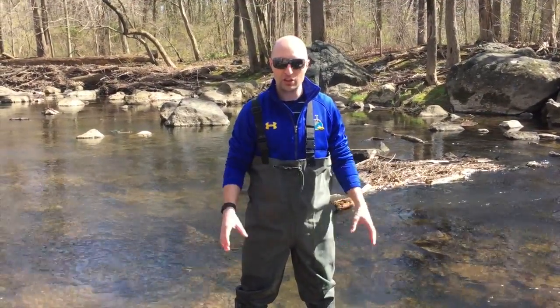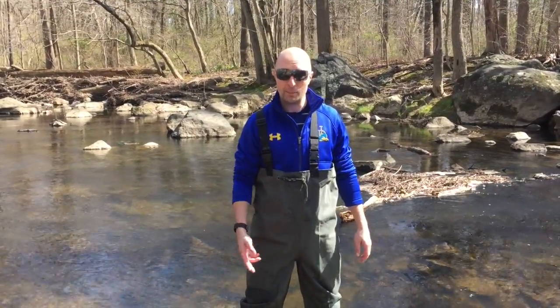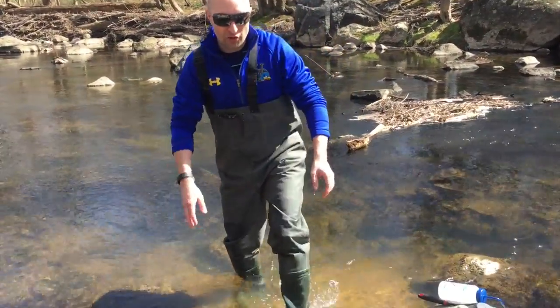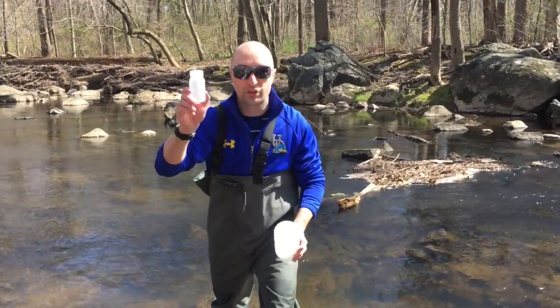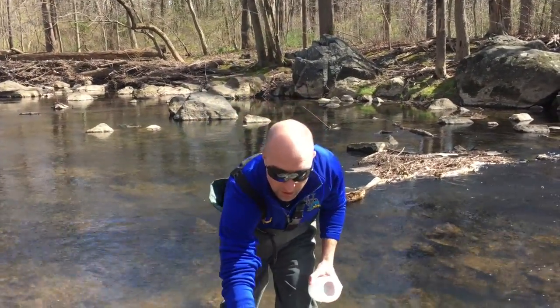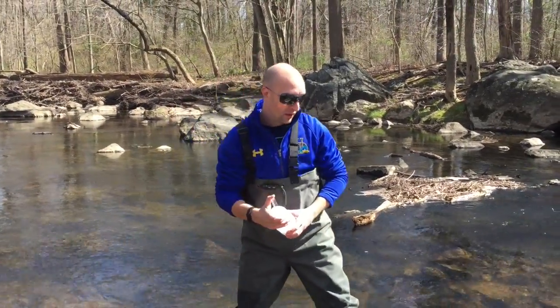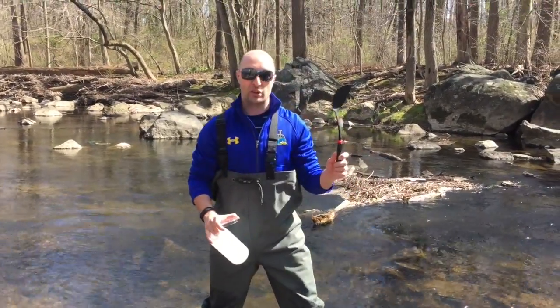The first part I'm going to show you is sampling on a soft substrate like sand or mud. There are a few pieces of equipment that you're going to need: a large composite bottle, a much smaller sample bottle, a petri dish, a squirt bottle, and a spatula.